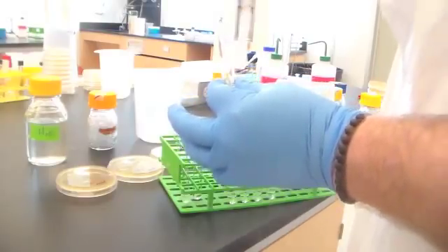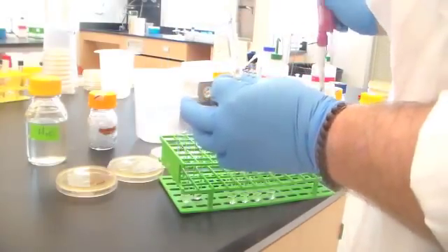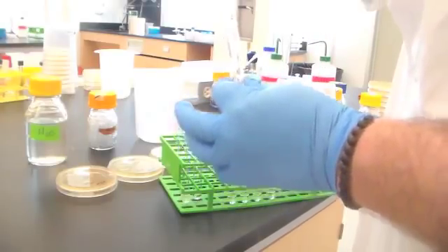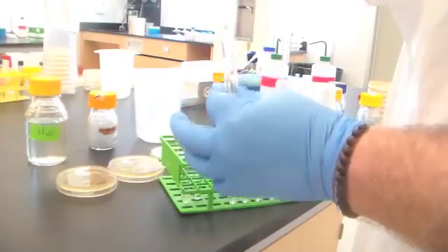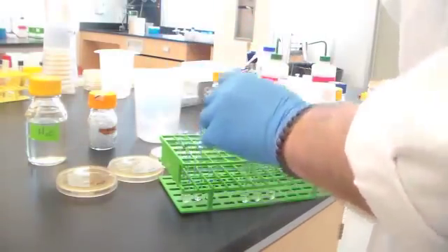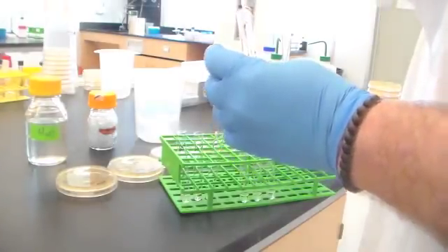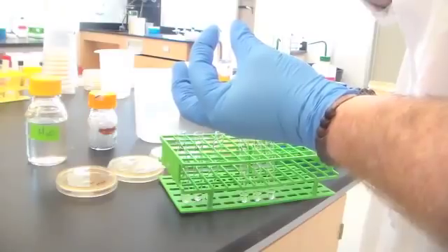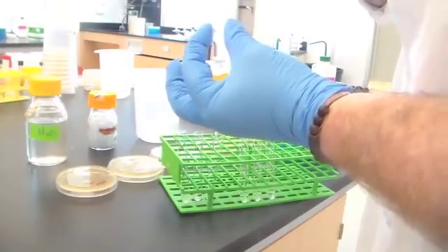As you do something as repetitive as tenfold dilutions, it's difficult not to get distracted, not to do things like I'm doing and carry on conversation, because it's very easy to forget where you're at, what you've pipetted into, what you've pipetted out of. Did you change the pipette tip?